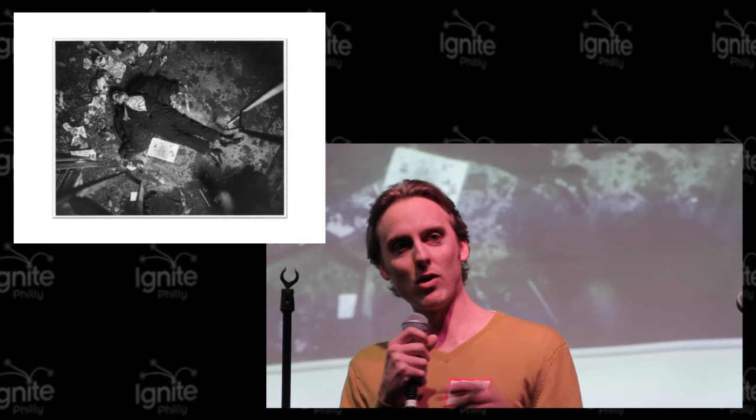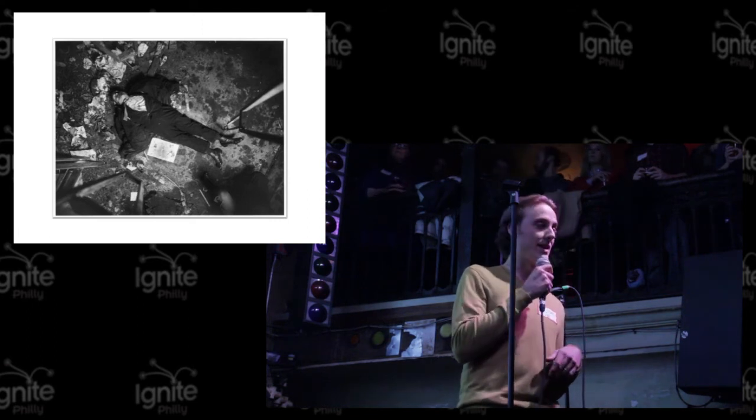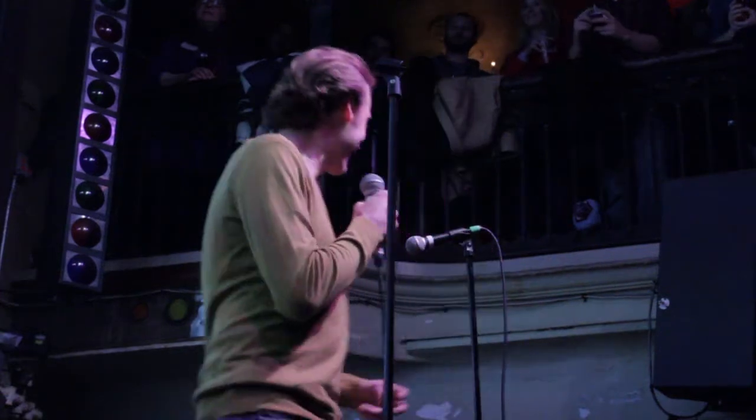We have a partner using Biomeme at crime scenes. So it turns out when you all die, a certain type of bacteria starts to grow. And the amount of this bacteria correlates with how long you've been dead. Yeah, it's true. It is.